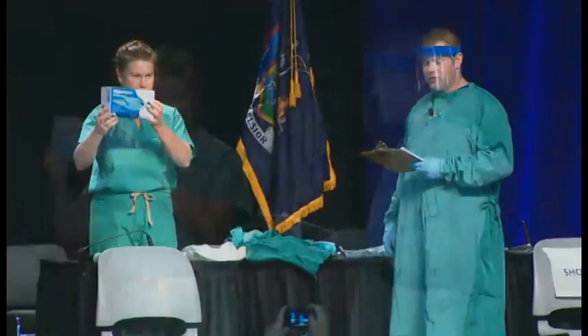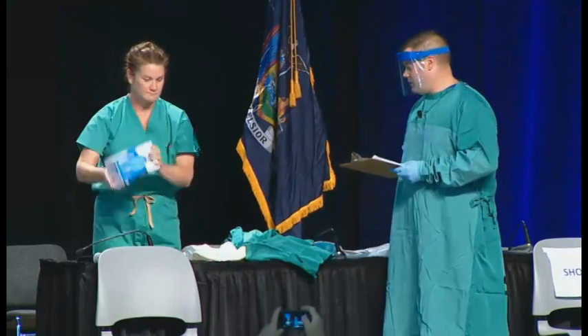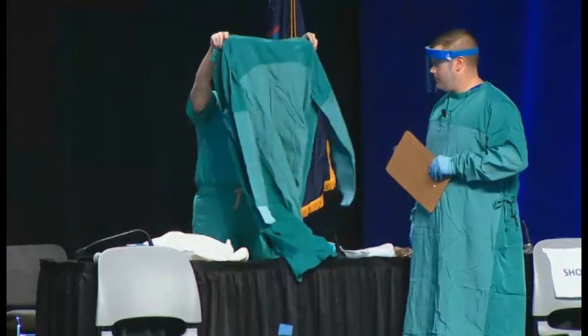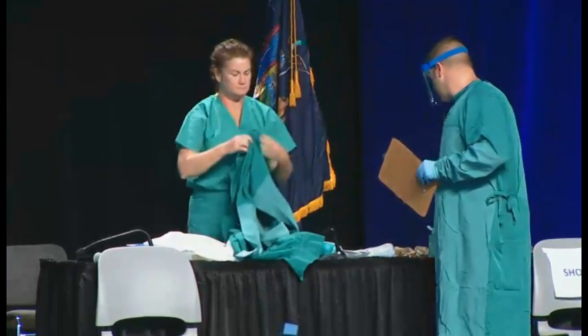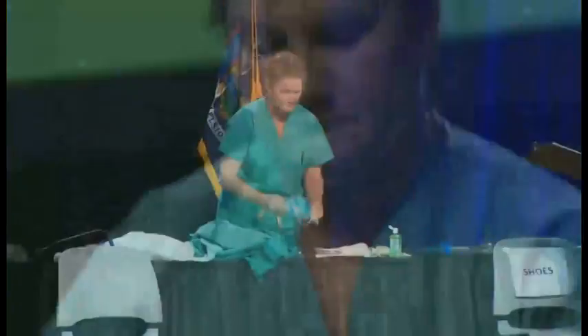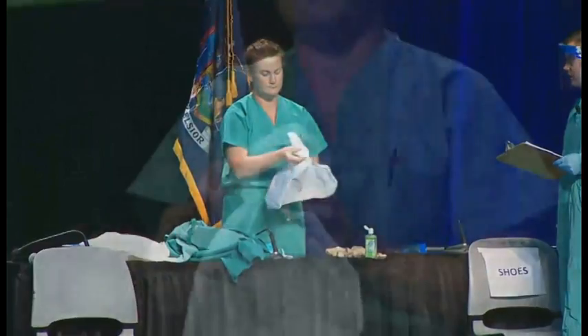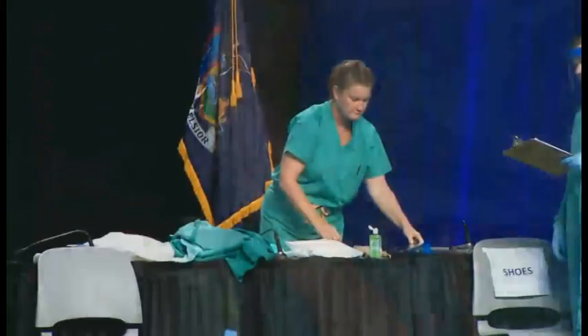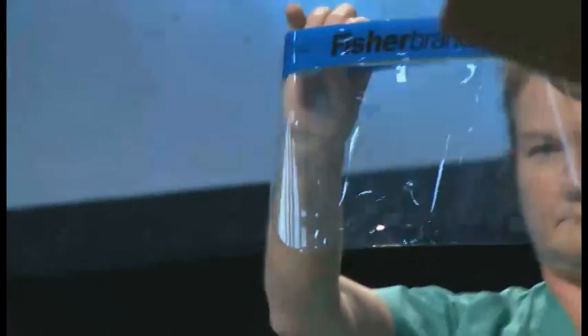First thing we're going to do is inspect our personal protective equipment, or PPE, to make sure that we have everything and it's laid out in the proper order. This list includes the inner gloves that are made of nitrile, shoe and leg covers that go to the mid-calf, a gown that is large enough to allow free movement and is fluid-resistant, a surgical hood that covers all of the hair, ears, and neck, outer gloves that have an extended cuff, and a face shield that provides additional protection to the face, including skin and the eyes.